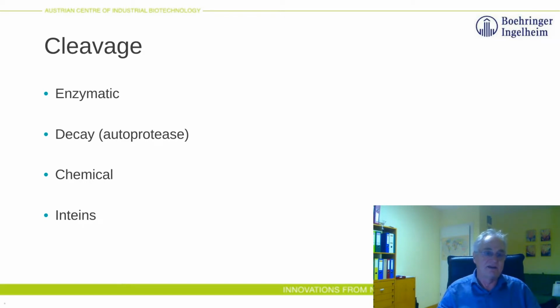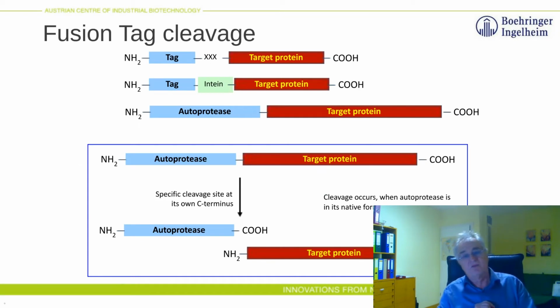Yeah? This is cyanogen bromide, which actually cleaves at the methionine, but then you have a lot of side reactions. This has been done in the past, and in insulin processes, chemical cleavage has been used quite a lot. Yeah? But due to a lot of side reactions, and you see you use a very hazardous chemical, this really has not become very popular.